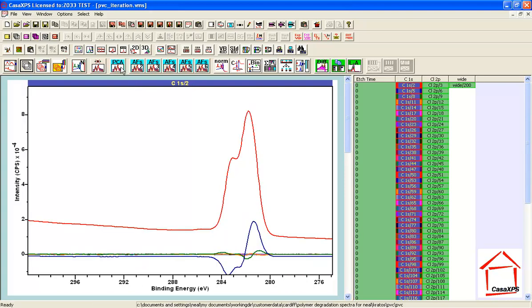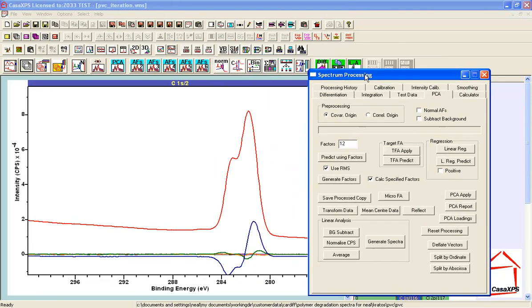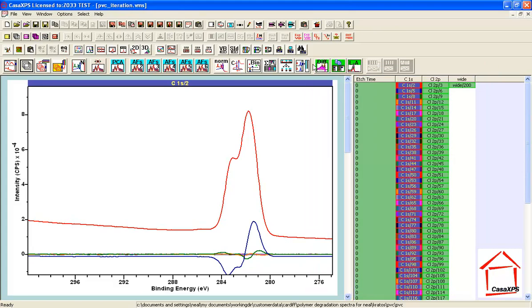There are a set of default values that have been used. They are possibly the same or different from what you see on the dialog windows, but they are designed to apply to a more general data set, and the more specifics of the PCA property page are designed to let you adjust parameters to optimize for different data sets. And that is essentially the difference between what has just happened based on the toolbar versus using the dialog window. There are a few other slight differences.